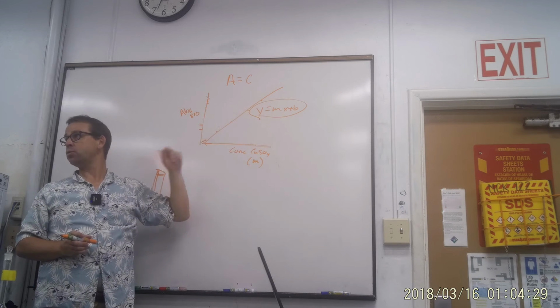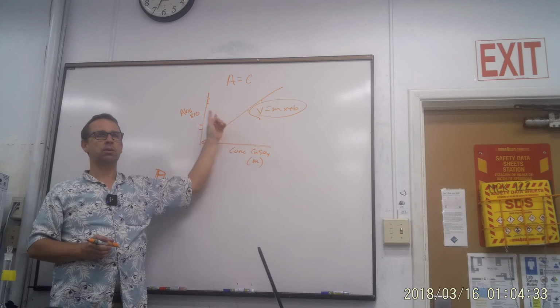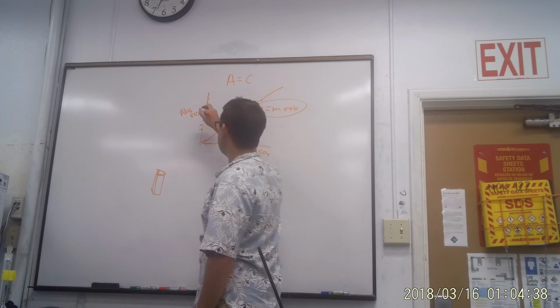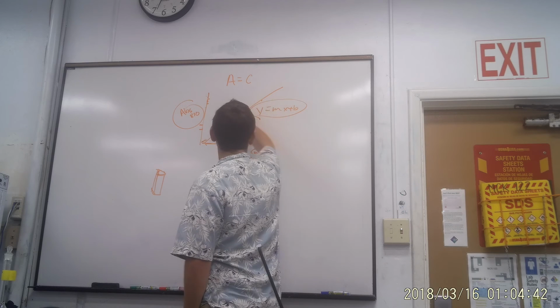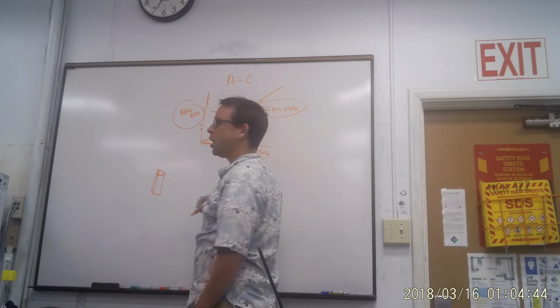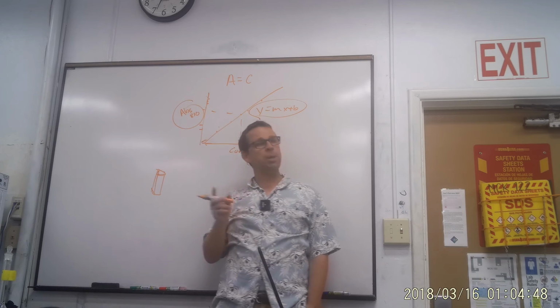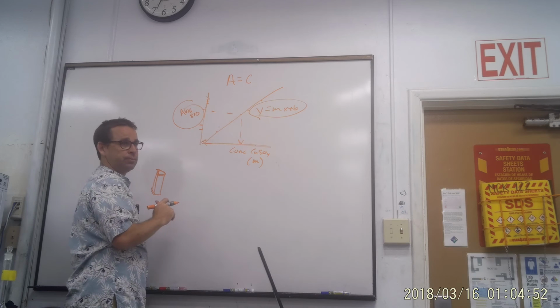It goes into which axes? Which variable? To the y variable, right? We're getting our absorbance on the y-axis. And then we can solve for x, and that should tell us the concentration of our absorbance, right? A lot of people make this graph incorrectly on the final.